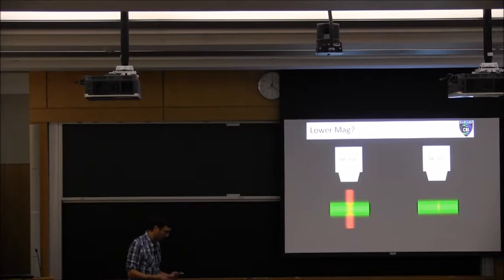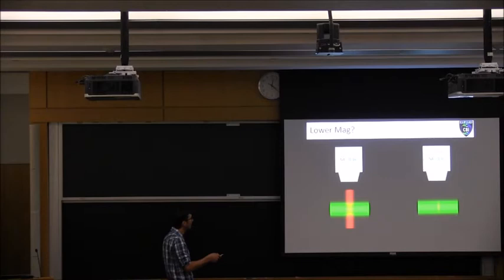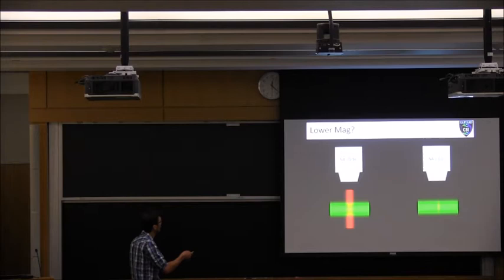Objective magnification and numerical aperture usually go hand in hand. So if you go to a lower magnification, you also get a lower numerical aperture. So here's an example of a 1.0 numerical aperture objective, which is what our 20Xs usually are, on the clarity clearing objective. And then here's an objective with numerical aperture of 0.16. So this is around what the 5x AIR objective usually is.